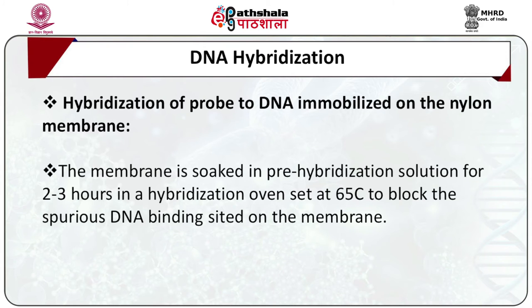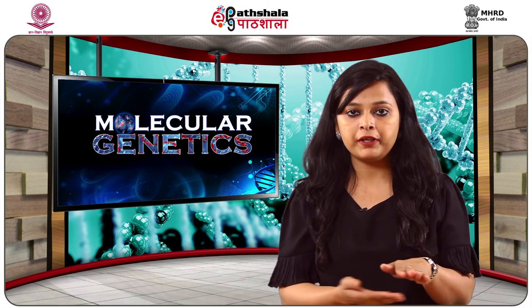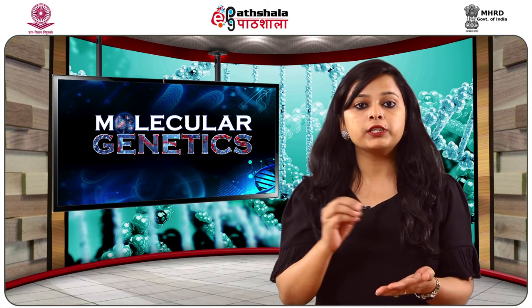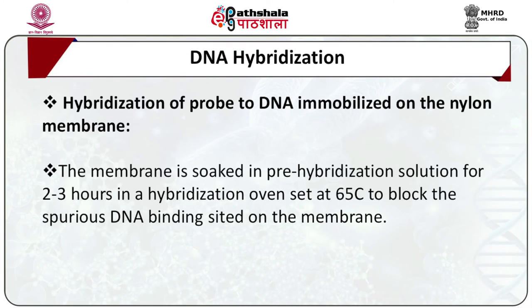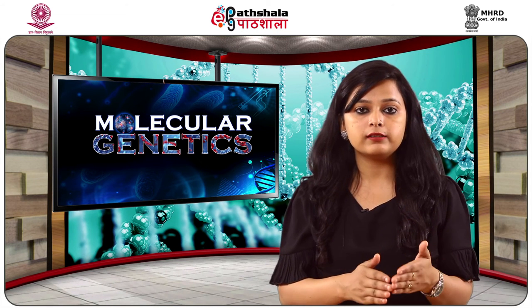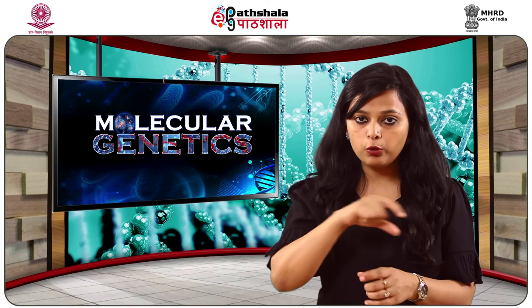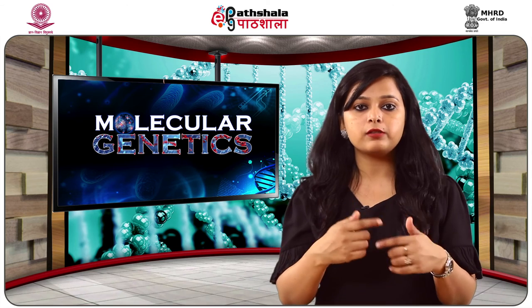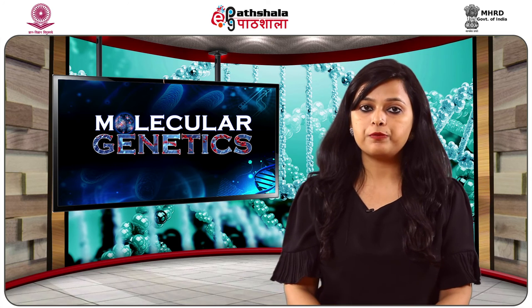During DNA hybridization in Southern blotting, the single-stranded DNA fragment immobilized on the membrane containing the gene of interest is detected using a probe for the desired gene sequence. For hybridization of the probe to DNA immobilized on the nylon membrane, the Southern blot is soaked in a buffer containing the hybridization probe, customarily in hybridization bottles under constant rotation for uniform exposure of all areas of the membrane to the probe.